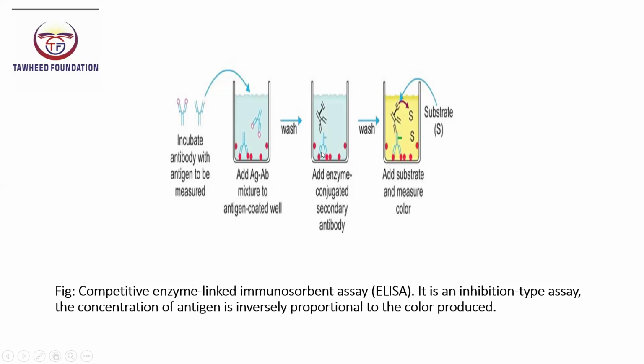So this competitive ELISA is an inhibition type assay where the concentration of antigen is inversely proportional to the color produced.